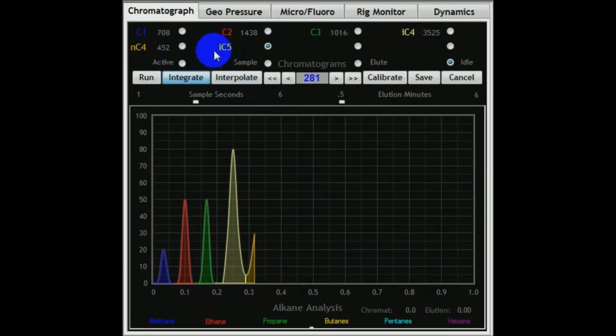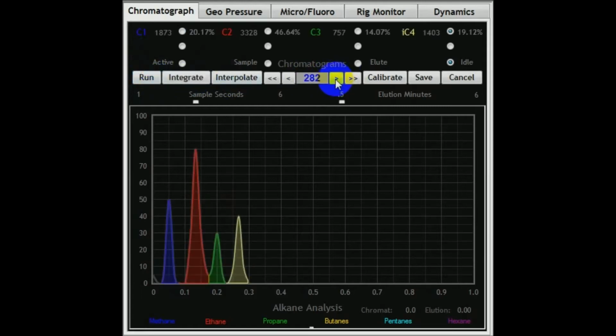First it's parts per million, the first data you see right after the colored component number. When we hit interpolate, this calculates the percentages of each gas relative to the whole and puts the numbers in the database. Only colored interpolated records are added to the database. If they're left in this state, the software overlooks them.